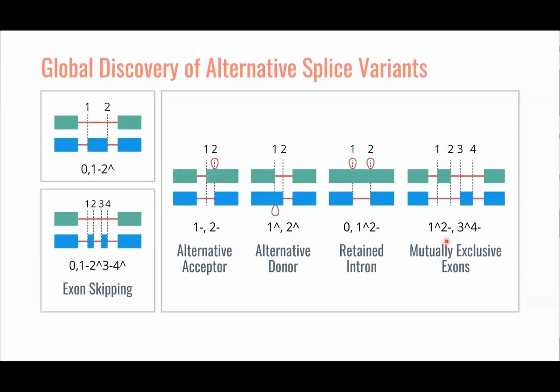Now, this is where Pavel and Jürgen have been really working hard on this data. And so we can take that idea of looking at isoforms and say, could we do a global analysis of alternative splicing? So this is a high-level characterization of different types of splicing you could get: alternative acceptor, alternative donor, retained intron, and so on. You probably read about these in your textbooks. But basically, there's different types of splicing that can happen, and nobody's really been able to assess at the protein level how much of these RNAs that get spliced actually make it into functional or viable protein that is expressed in the cell.